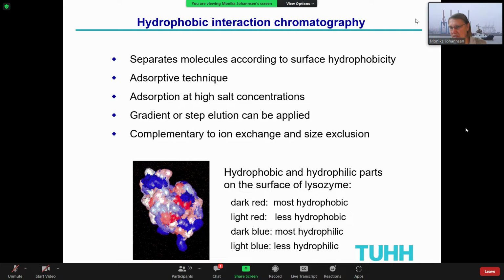There is a question in the chat I just saw, regarding the ion exchange chromatography, a question about scaling and fouling issues. And yes, of course, always if we deal with fermentation broths, we also have a problem of fouling, and at high salt concentration, perhaps also scaling.